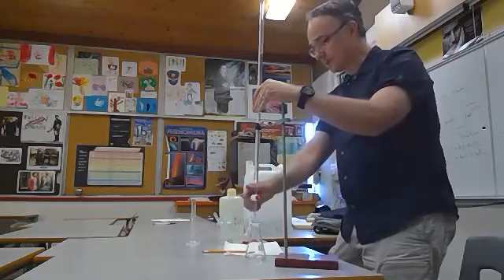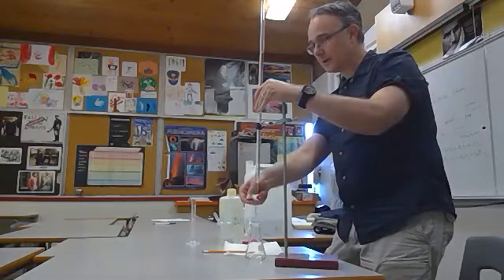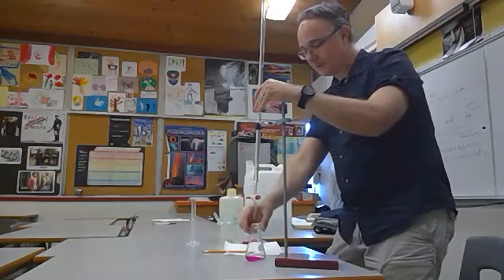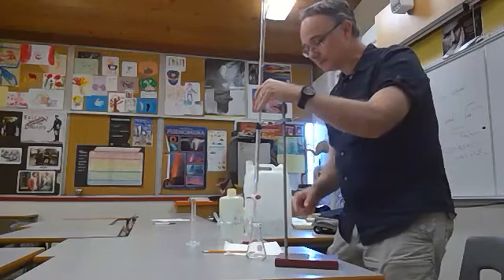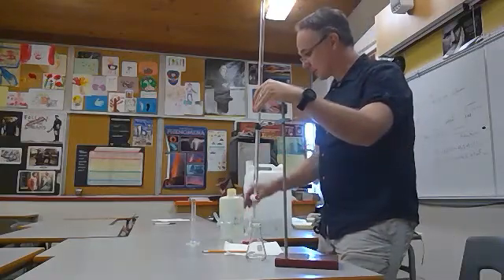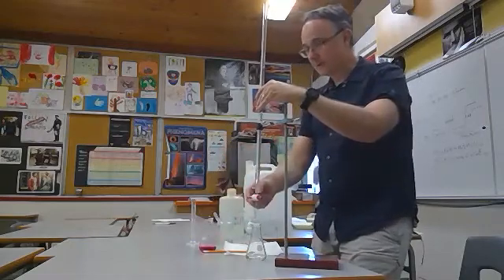I did 22 mils before, so I'm going to add 5 more. That should be okay. It's gone again. Now I'm about 15 milliliters in, and I'm going to start adding smaller amounts so I don't overshoot the mark. Once again, that's just too dark. I added way too much base there. So I'm going to add maybe a mil at a time.